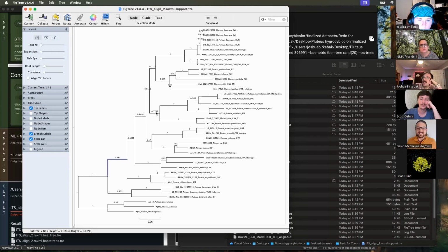But mentally collapse these relationships. If this has these two clustered together, but with low value, don't think of them as next to each other in your mind, even though they show up that way on the tree.